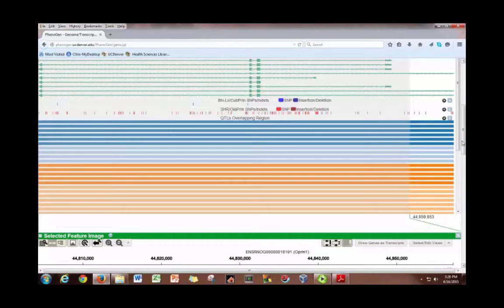for the particular RI panel that most of the data is based on, the 2 parental strains, if you remember, are the BNLX and the SHR. And so what this is showing is all SNPs, or small indels, for those 2 strains. And so why that's important with a recombinant inbred, if you remember, these are the 2 parentals. So any of the children, these are the possible SNPs that they have.